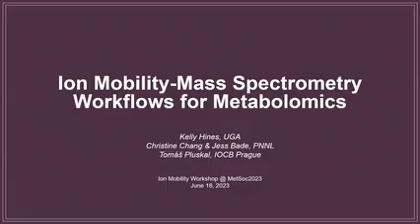Tomáš Pluskal from the Institute for Organic Chemistry and Biochemistry in Prague will talk about MZmine 3. And then Jess, Bade, and Chang from PNNL will talk about their new program, DEIMoS. And then we'll come back to me at the end to talk about methods for collision cross-section predictions and resources for where you can find CCS values for metabolites.